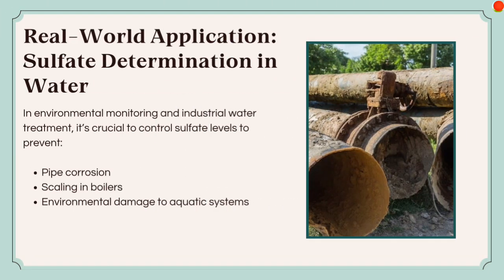I'll be talking about a real-world application of sulfate determination in water. Sulfate analysis is very important, especially in environmental monitoring and industrial water treatment. Monitoring sulfate levels helps us avoid several serious problems.